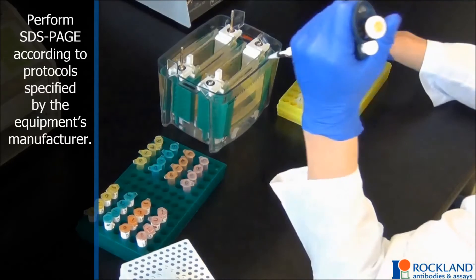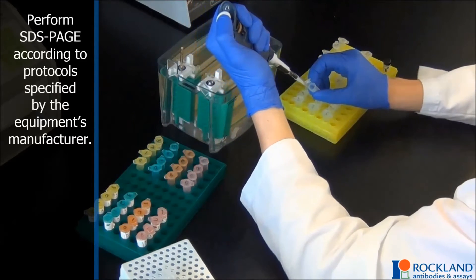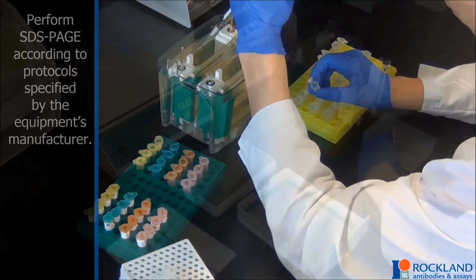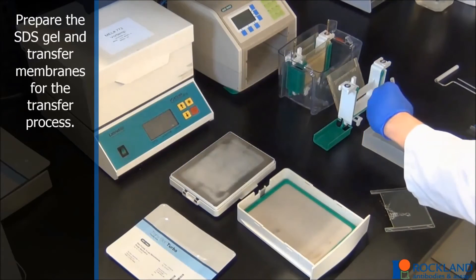Perform SDS-PAGE according to the protocol specified by the equipment's manufacturer. Prepare the SDS gel and transfer membranes for the transfer process.